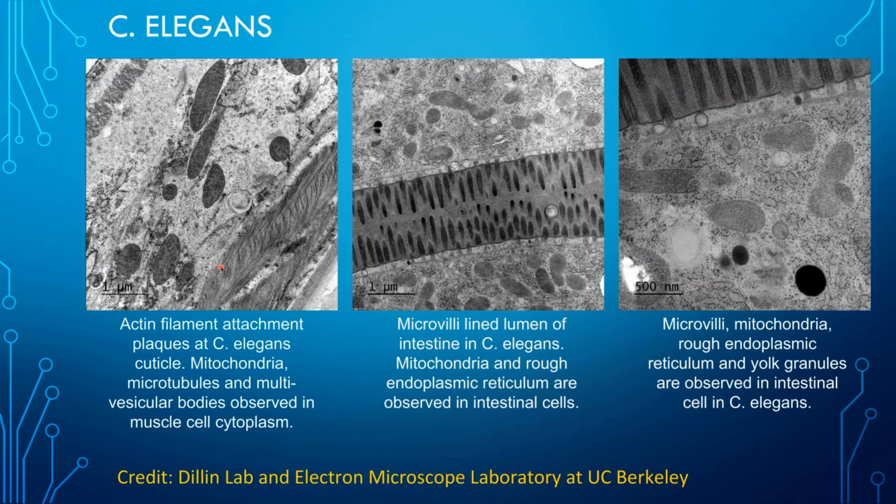Here's an example of C. elegans. These are small worm model systems, and this is something that we frequently image in our facility. On the left here, near the cuticle, you can see different bands of actin, and then mitochondria that are in the muscle cells. You have this really beautiful resolution to decipher fine filamentous protein structure in the background of a cell mixture. We can see individual ribosomes, and it's a little difficult to impress in just a PowerPoint how beautiful the data really is.